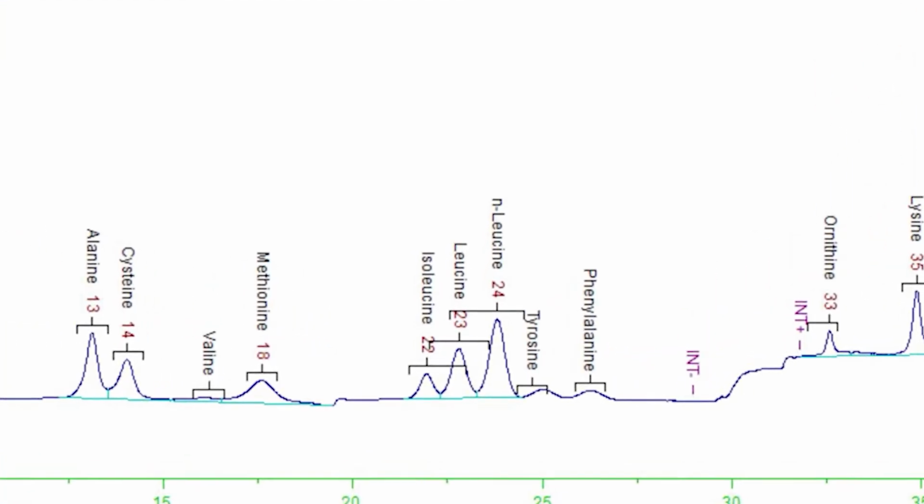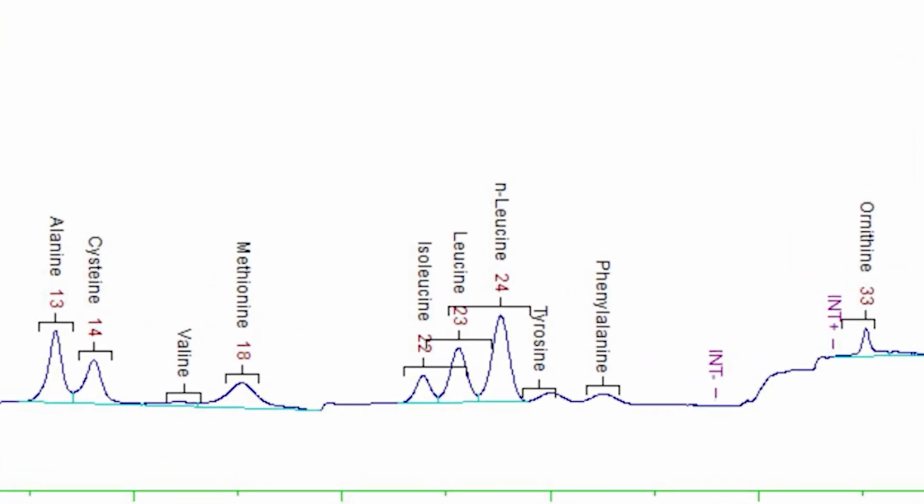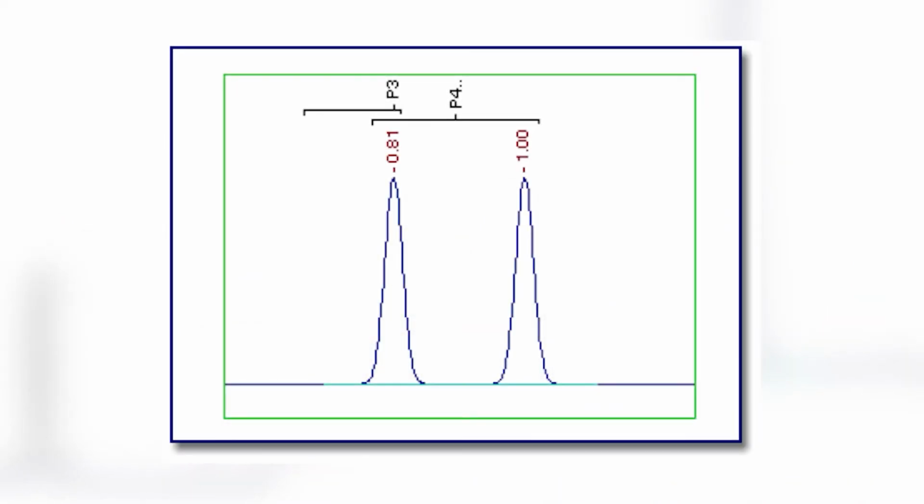No component may be identified with more than one peak, and no peak may be identified with more than one component. This essentially simple process becomes complicated when search windows overlap. A peak that is under two windows may be the centermost peak of both. These conflicts must be resolved. By convention, the peak is assigned to the narrowest window, or the earlier window, if there is a tie.